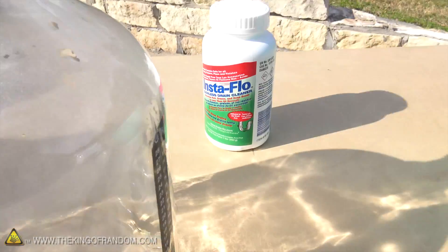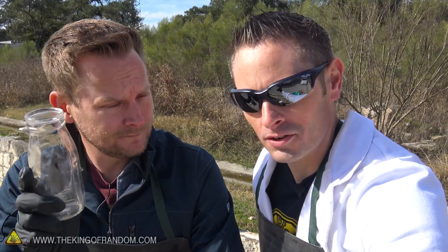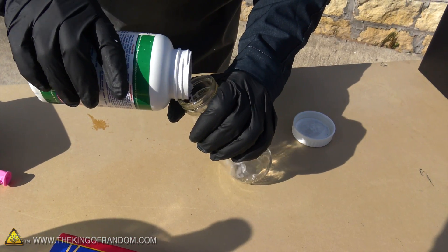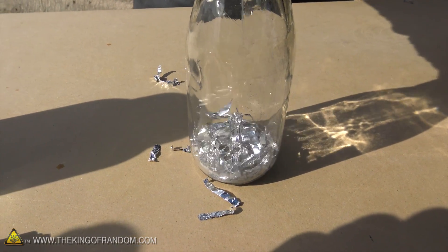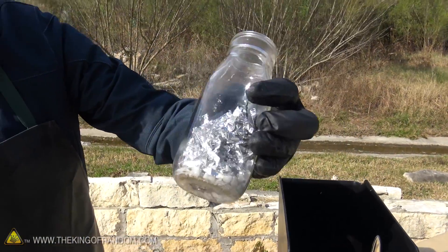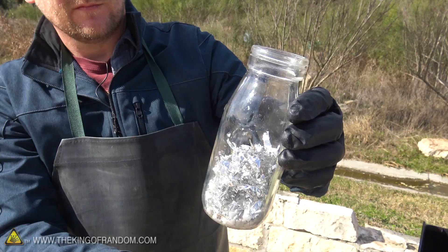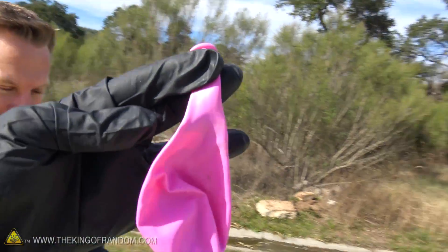We've got our shredded aluminum, we've got our drain cleaner, and all we need now is a little bit of water. When dealing with chemical reactions, it's not a bad idea to start a little bit smaller and work our way up, so we're gonna start off with this small glass bottle. Lye is sodium hydroxide — NaOH — and the aluminum is just aluminum metal, Al. We're gonna mix in some water, and as we do that the sodium hydroxide is gonna dissolve, react with the aluminum, and release hydrogen gas. That gas is what we're after — that's why we've got the balloons.